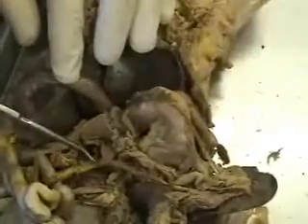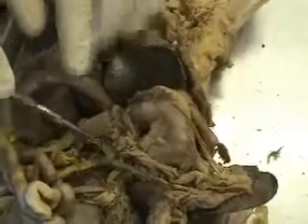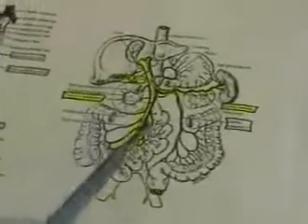You have a similar diagram showing the superior mesenteric vein and the splenic vein joining together to form the hepatic portal vein in my human anatomy lecture outline on page 014, the top diagram. So then you can go and check it out and see that that's what it is. Okay, let's stop. This is page 014.